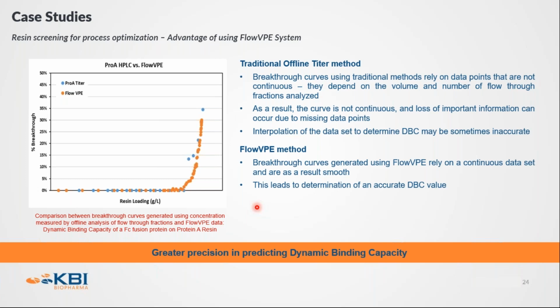Great. So I see that that's kind of the list of questions. I'd like to ask my own question. Could you foresee a situation in the future where this type of method is used in real time during manufacturing, or maybe in a batch mode, or even in a continuous mode where you could put this instrument in line and actually do real time column loading? Yes, I definitely foresee that type of use for this instrument. I also understand that these instruments are made GMP friendly, so we can definitely monitor the column effluent concentration and take important decisions based on that.